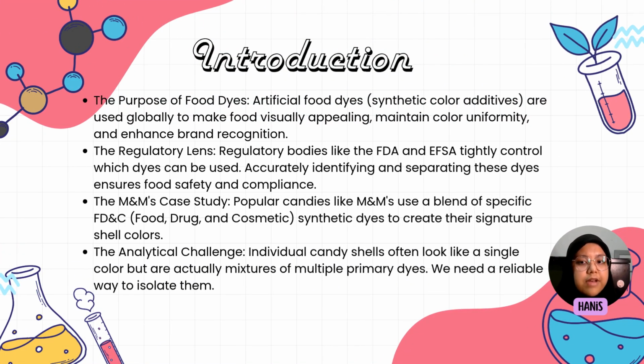Synthetic color additives are used globally to make food visually appealing, maintain color uniformity, and assure brand recognition. Regulatory bodies like the FDA and EFSA tightly control which dyes can be used. Accurately identifying and separating these dyes ensures food safety and compliance.